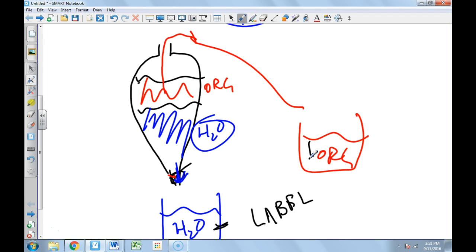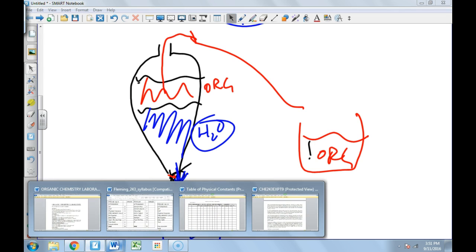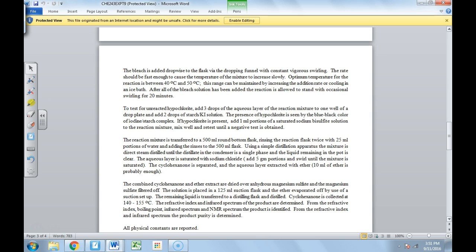The other thing, again good lab technique, is I try not to get rid of layers until the end of the lab experiment. That way I know it's all still there, and once I have my spectra or my chromatograms or whatever I'm running to characterize this, I know once it's good that I can now get rid of everything. If you get to that point on the first night, that would be awesome.